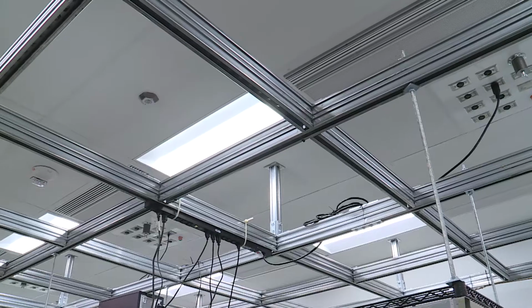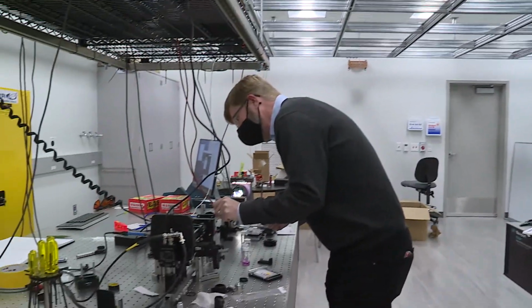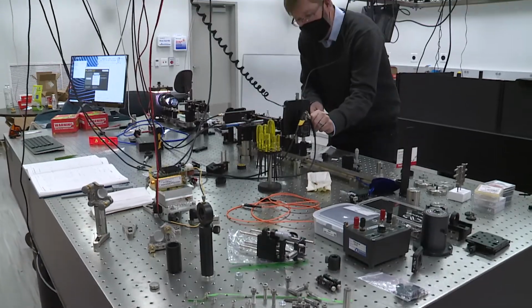We use the lab to make measurements on solar active materials in small magnetic fields, and we hope that these measurements will reveal many more details about these materials than you can get from other spectroscopies. And we have graduate students and undergraduates from all over the country and all over the world that work in these labs to make these measurements.